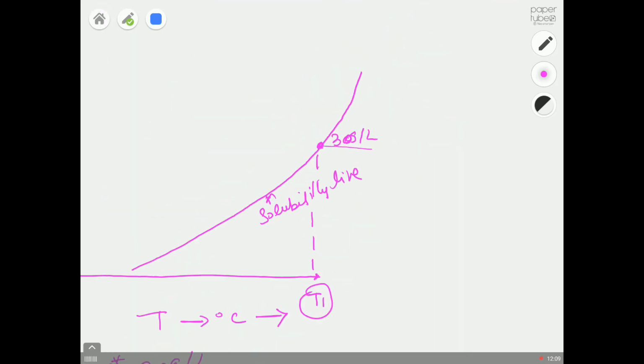So heat to some temperature like T1 plus 20 degrees centigrade, and then wait at that final temperature, T1 plus 20 degrees centigrade, maybe for 1 hour. So all these 30 grams per liter will be dissolved completely, and then you cool the solution back as fast as possible to your saturation temperature. So this is your saturation temperature, and then you cool the solution at a fixed rate of 1 degree centigrade per minute.